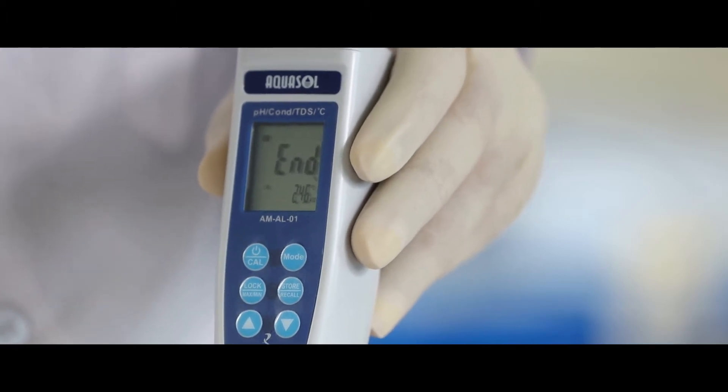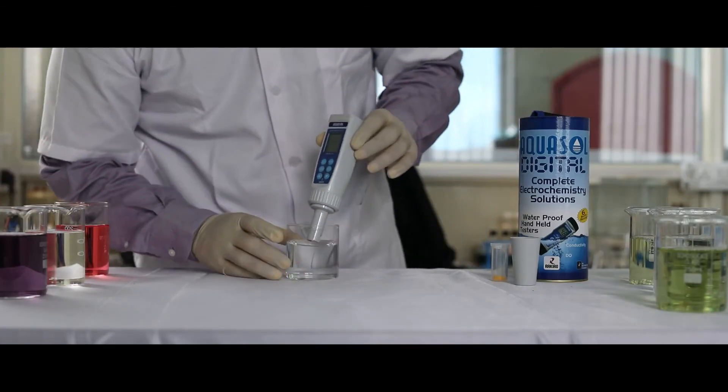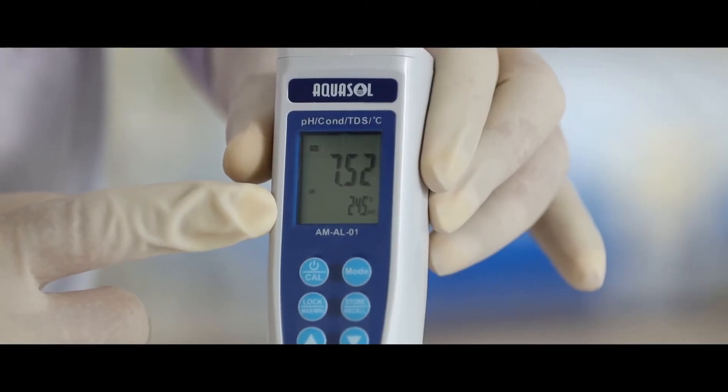Once the device is calibrated for pH, let's test the pH of the sample. Dip the electrode in the sample. Stir gently for a stable reading.